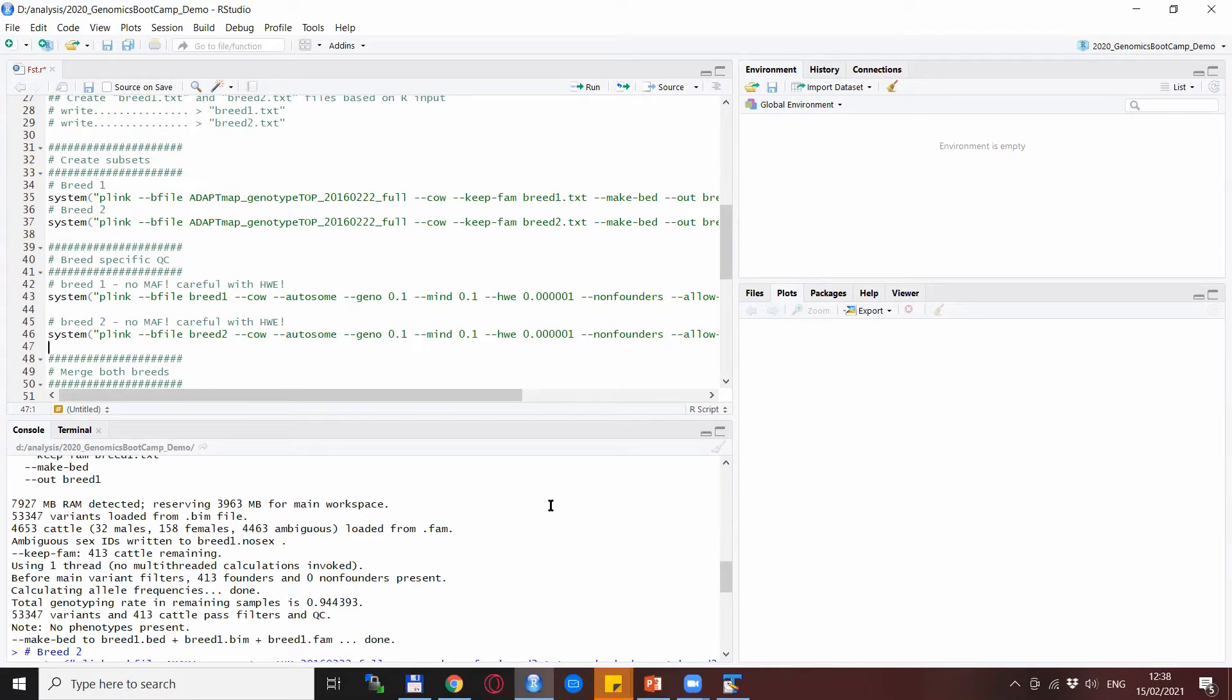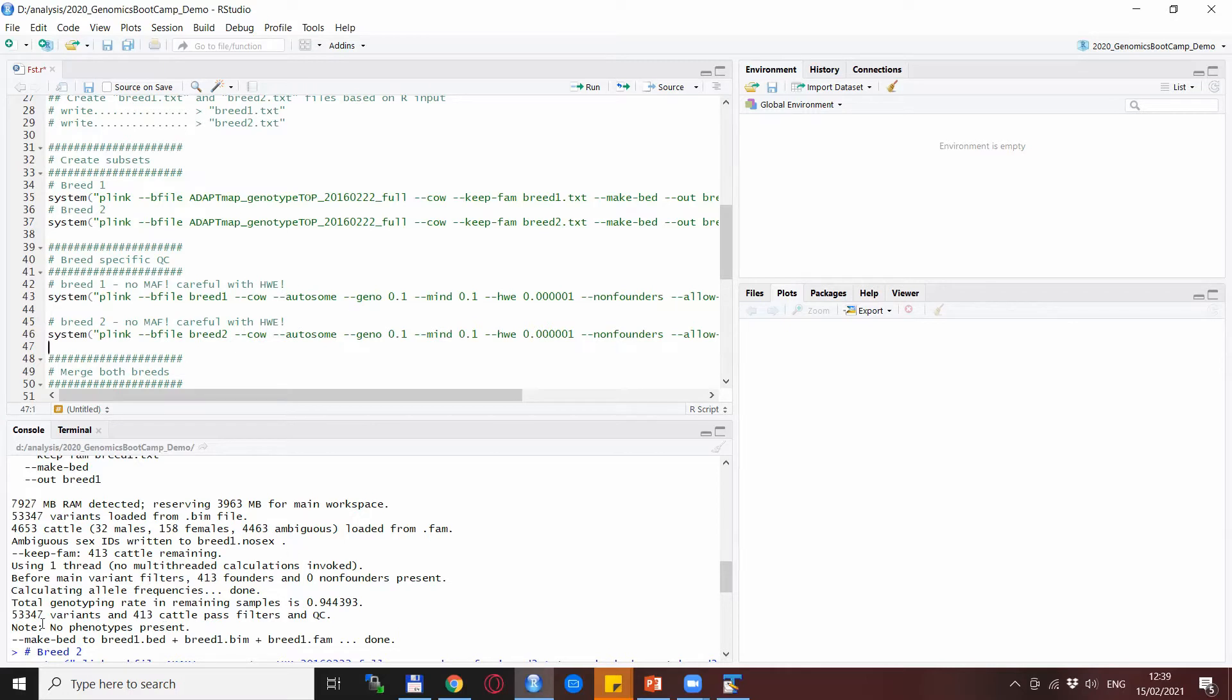The first one is the extraction of the first breed, Angora goats. There are 413, so a number of Angora goats actually from multiple countries, and we have 53,000 SNPs remaining.